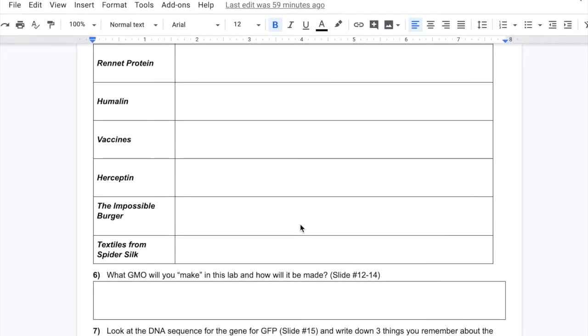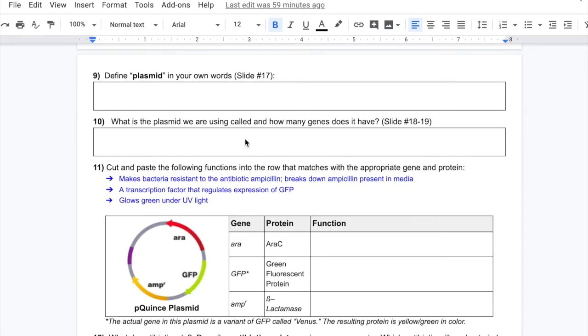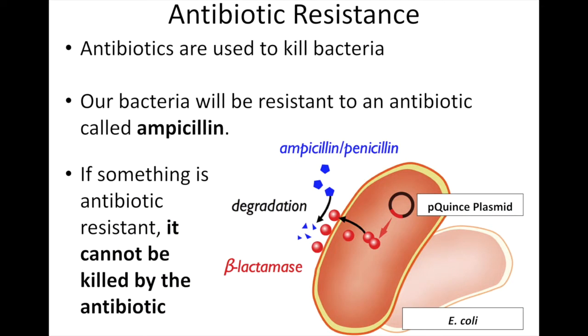Next, students begin exploring what a plasmid is and how, in this example, production of green fluorescent protein can be regulated by a specific transcription factor. We also introduce or review antibiotics' effects on bacteria and resistance conferred by plasmids.